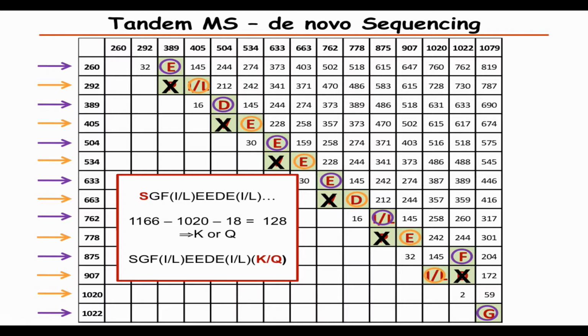This is the case when you don't have a database, and this is what you have to do. There is some software out there that can do this or can help you with it, but it's really far from perfect. And it's still a problematic case when you don't have a good database.